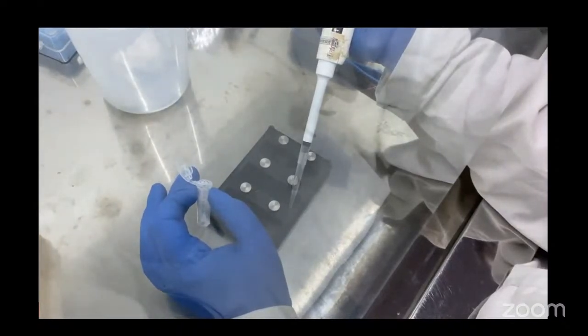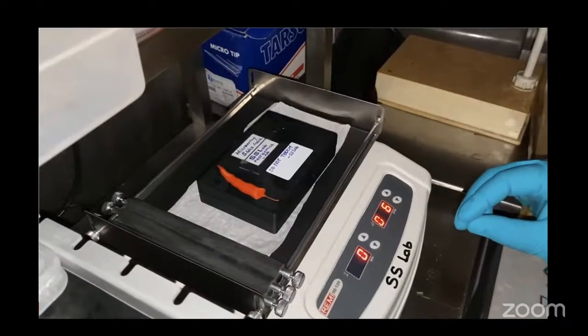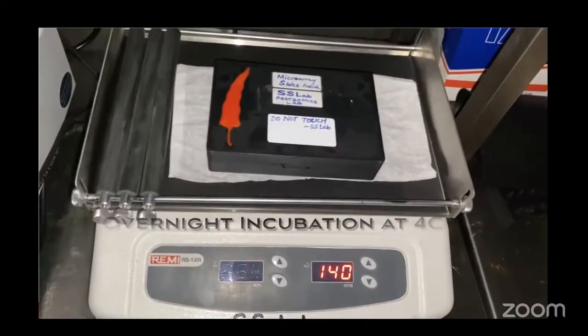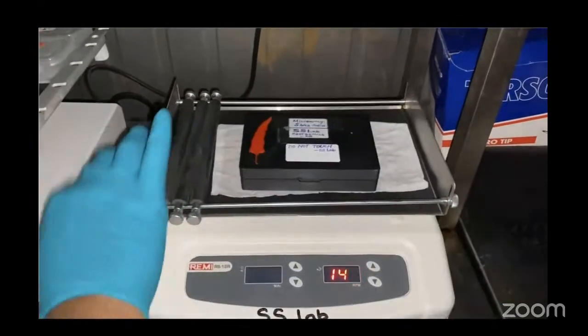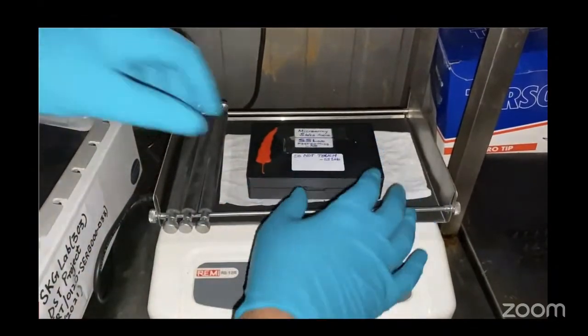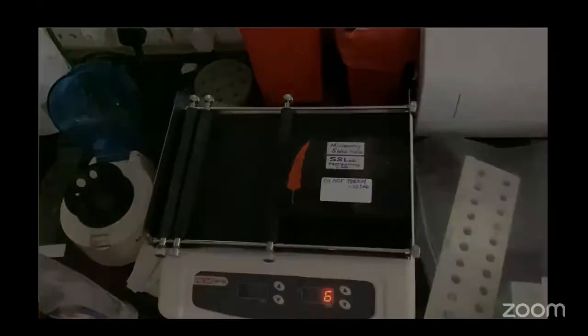This will be done in a cold room at 4 degrees Celsius at 140 RPM on an orbital shaker. On the next day, remove the incubation tray from 4 degrees Celsius and aspirate the solution. Now add washing buffer thrice onto the chip. This step is done 3 times in the dark.